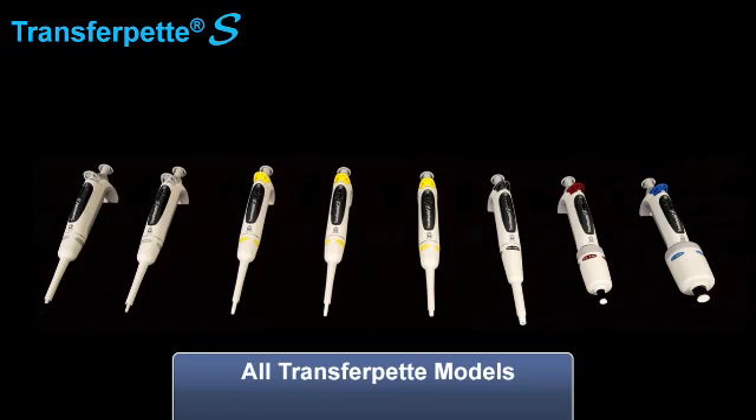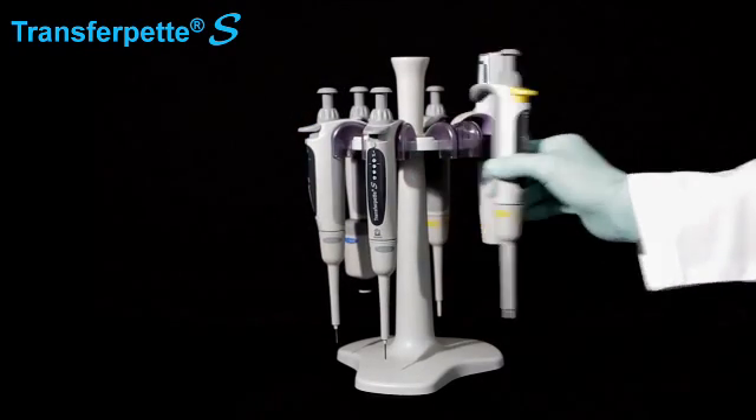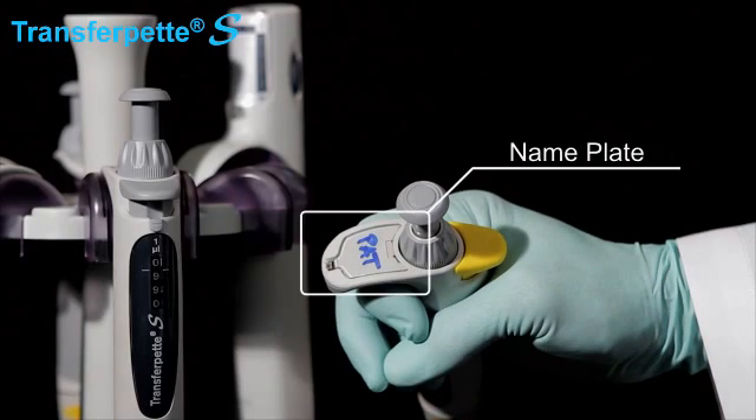All TransferPets are color-coded by volume for easy identification and selection. A covered nameplate allows for personal identification without the use of messy tape.